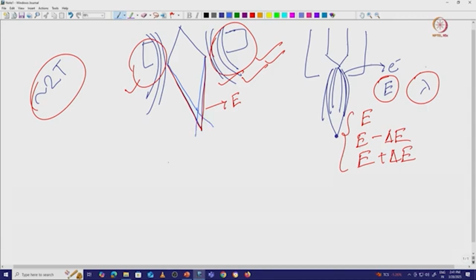So you can see there is a similar appearance to the glass lens system. In a glass lens system, parallel rays are coming along the optical axis.